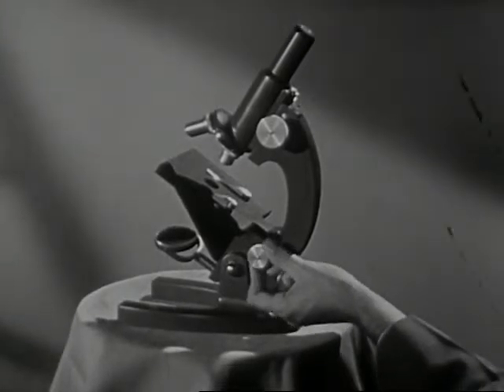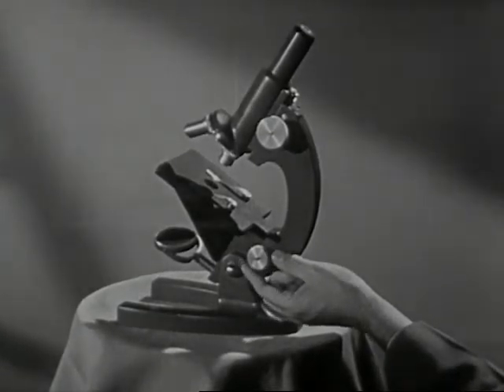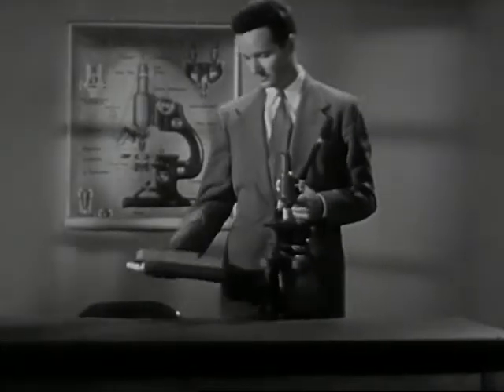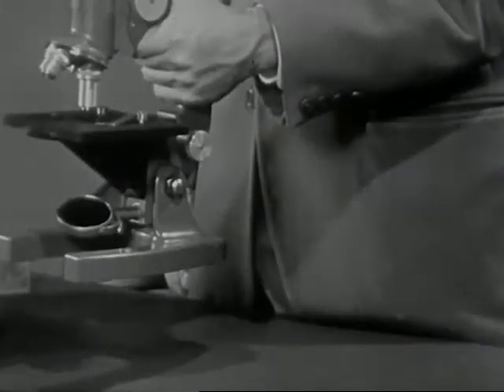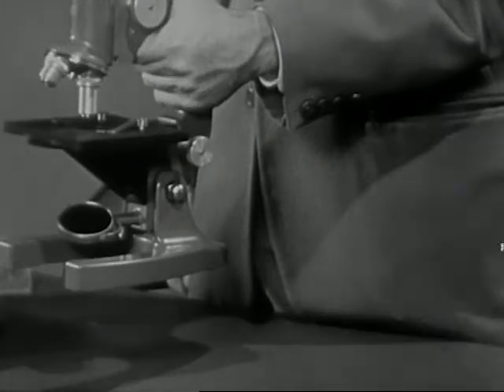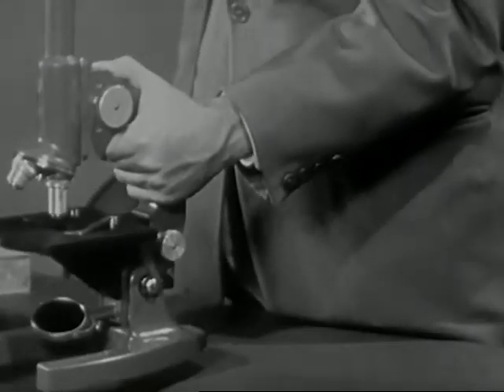An additional focusing knob is found on most modern microscopes. It is used for critical focusing, which we'll learn more about shortly. So you're ready to begin using the microscope. Care in moving the instrument from place to place is one of the first precautions you must learn. Always carry the instrument by gripping it firmly. Carry it carefully in front of you and keep it upright so the eyepiece can't drop out.